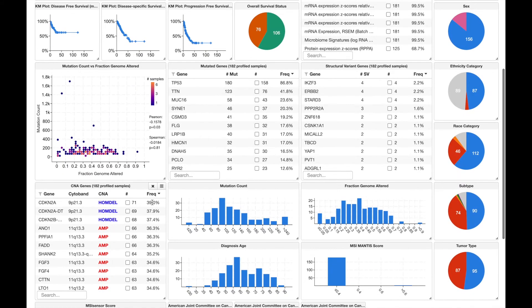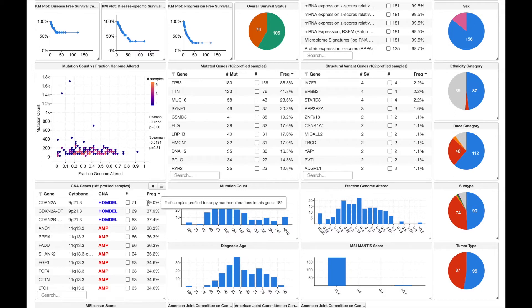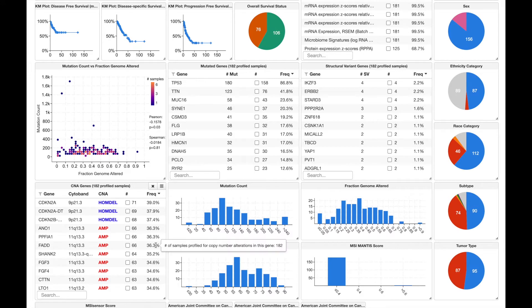Continuing along, we also have a table that shows us the most frequently copy number altered genes. We can see that CDQA is deleted in 71 samples, or 39 percent of the cohort, and there are a number of genes all located on the same cytoband, 11q13.3, that are all amplified in around 35 percent of samples.